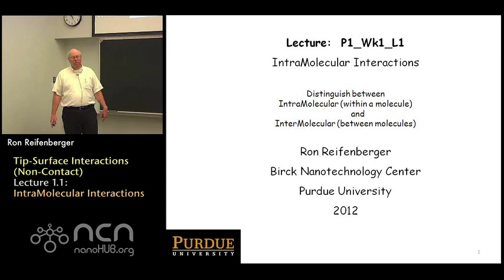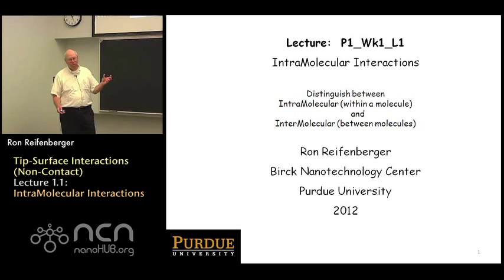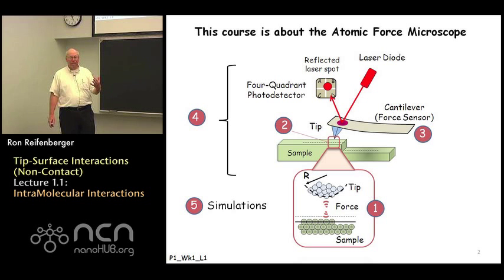So today what I'd like to do is start this course by having a general discussion of intramolecular and intermolecular interactions and set the stage for what we're going to cover in the first week of the lecture. Before I do that, it's worth briefly summarizing what the first part of this course is all about. And of course, it's about an atomic force microscope. We're going to cover some basic elements of the atomic force microscope as I've indicated in this particular slide.